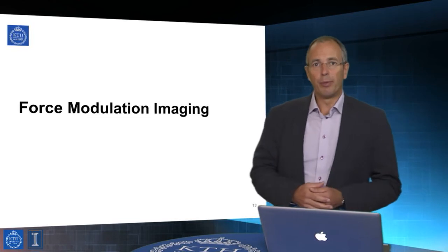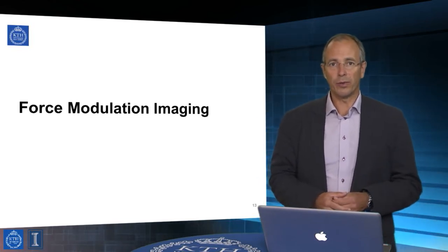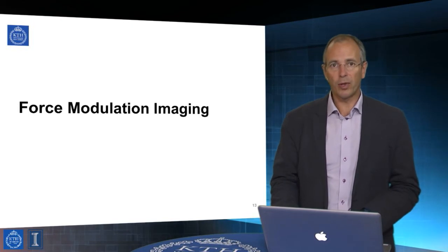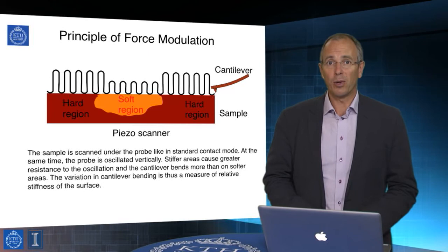Okay, so that's a very, very brief introduction to phase imaging. It's definitely one of the workhorses of the AFM armory. Force modulation imaging is perhaps not used so much now. It essentially combines tapping mode and contact mode, if you like.